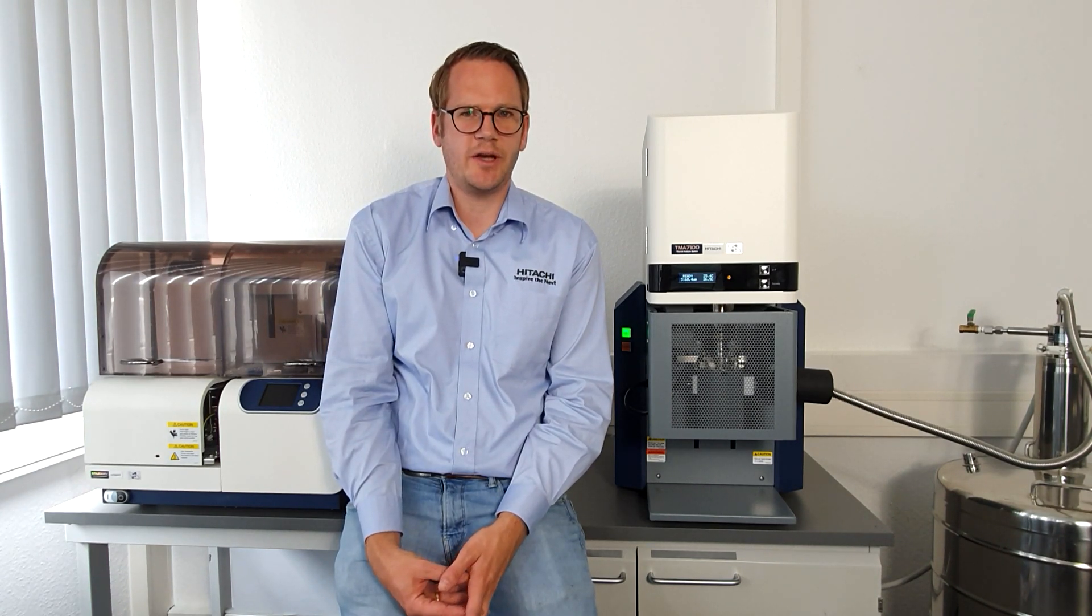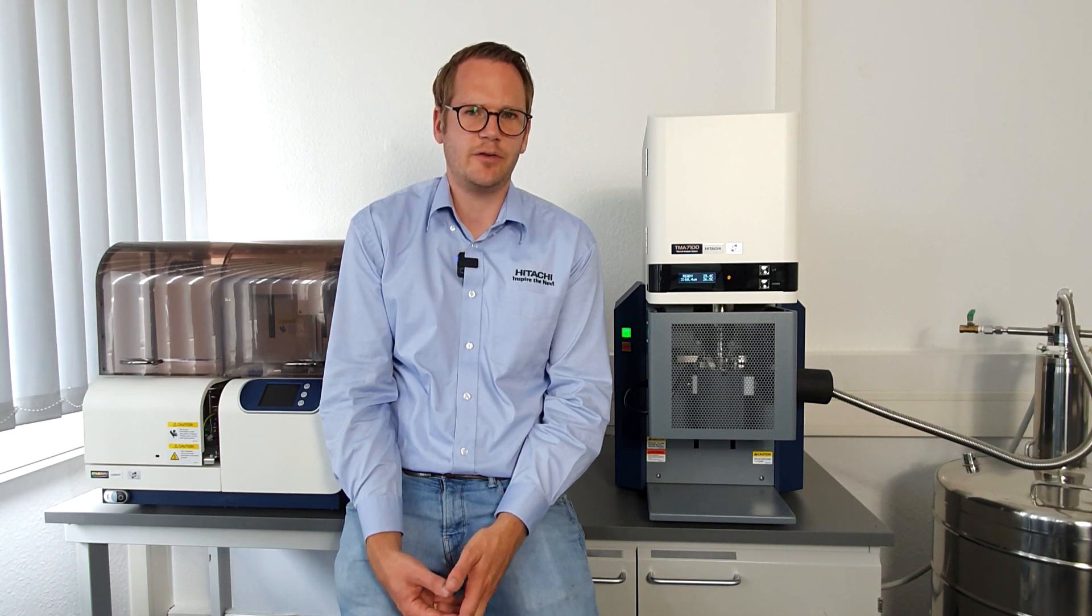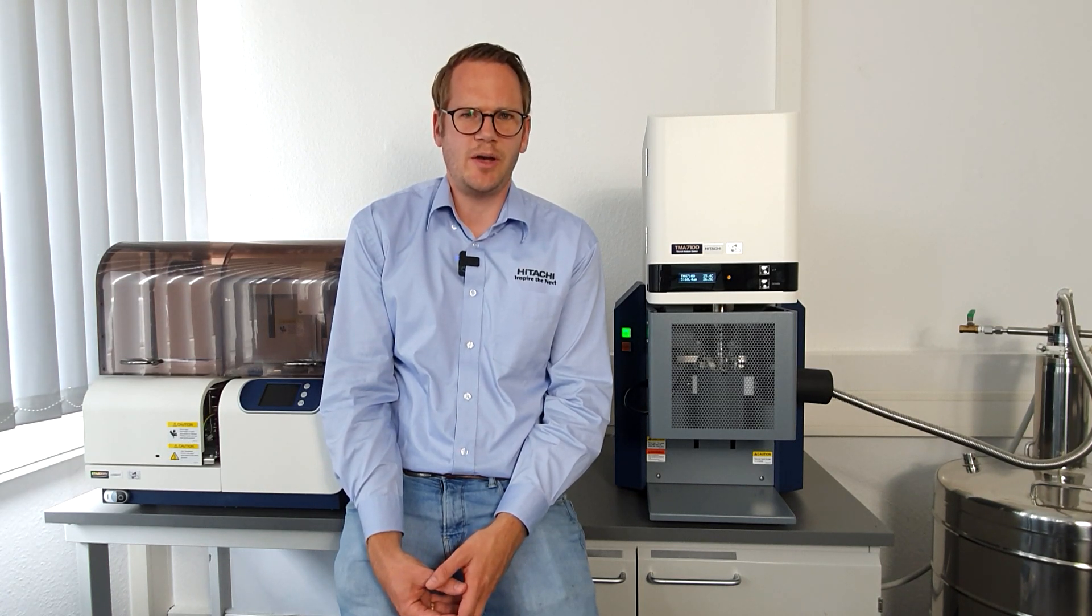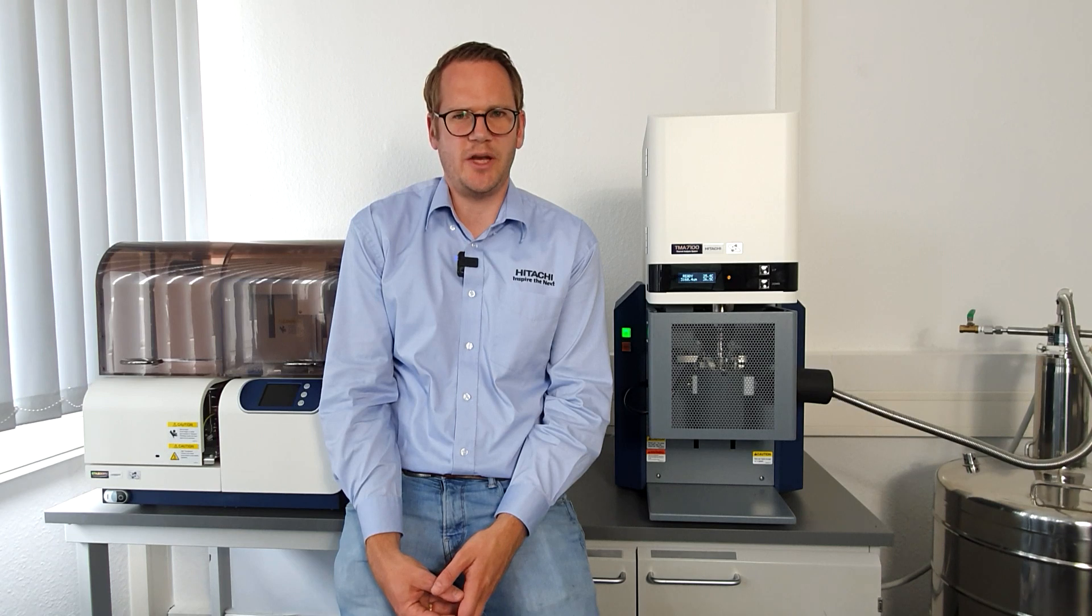TMA, that's a thermomechanical analyzer, and this kind of instrument is used to determine properties like shrinking or expansion of your samples.